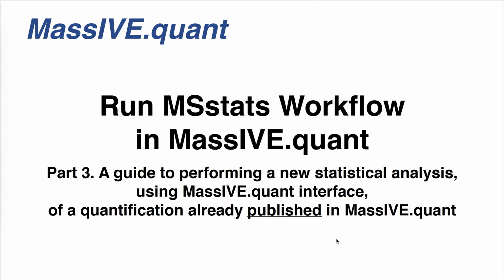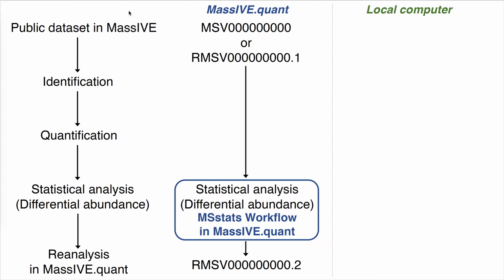Welcome to MassIVE.quant. This video will talk about how to run the MSstats Workflow in MassIVE.quant, especially using the quantification already published in MassIVE.quant. This part is a general workflow of how we can use the dataset in MassIVE. In MassIVE, there are many public datasets. So let's think about only one public dataset.